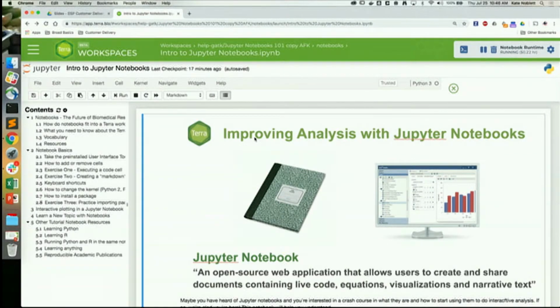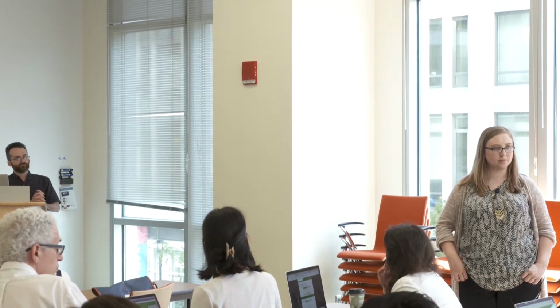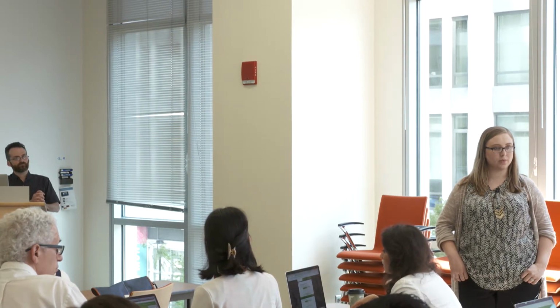So just going back to deleting versus pausing a cluster. The notebook stays somewhere where you can always access it. And if you wanted to start the cluster again, you don't have to do anything except hit that play button to start it again, right? And it takes some time to load up. So deleting the cluster, you're just taking away a virtual machine, but the notebook stays there. So you don't really have to do anything new if you want to run that same script again.